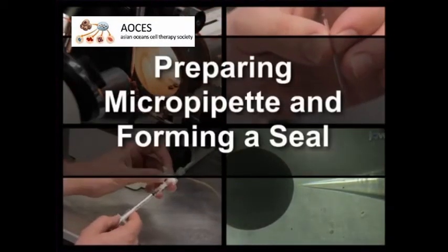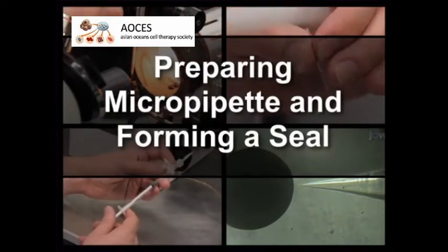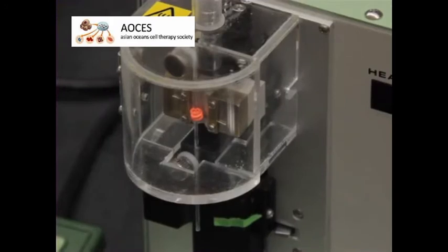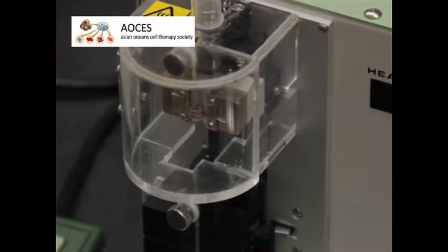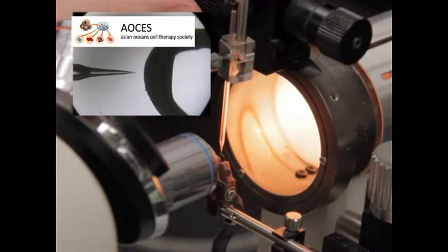Now that we have reviewed the principles, let's go over the steps required to perform a patch clamp recording. Start by pulling a borosilicate glass tube into micropipets using a pipet puller. Next, fire polish the tip to obtain the appropriate diameter and resistance.